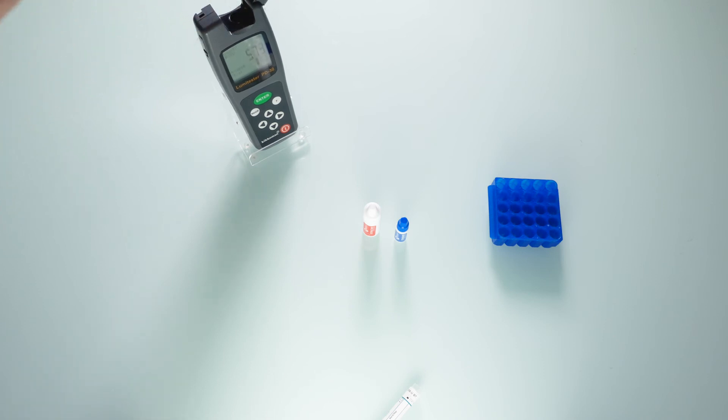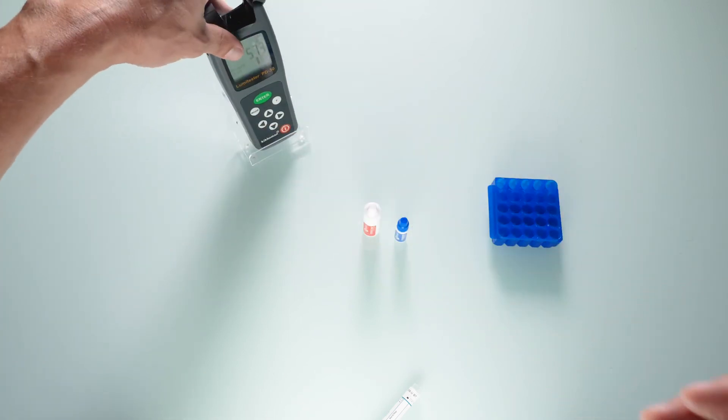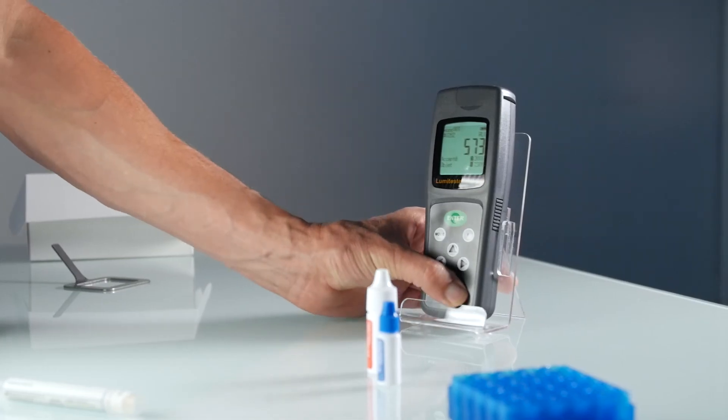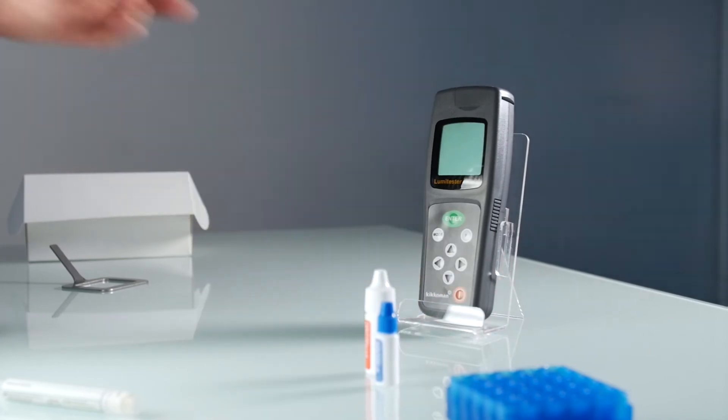Before turning off the device, remove the tube and its holder. The analysis is now complete.